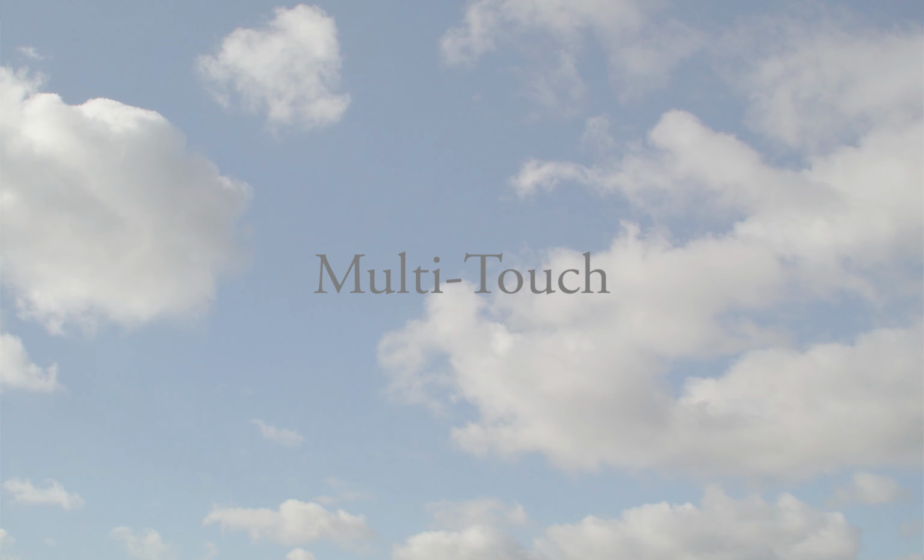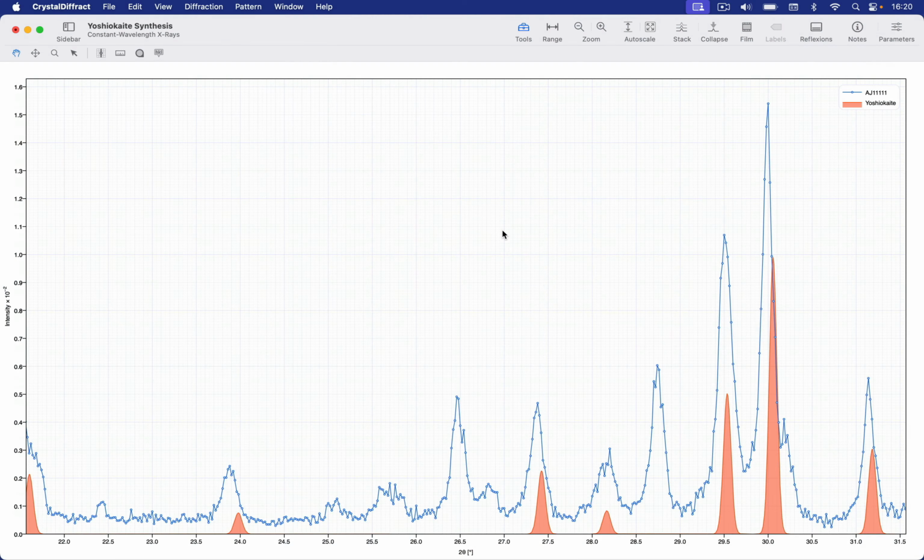For many Mac users, the easiest way to scroll and zoom will be via a multi-touch trackpad. Windows users might have a multi-touch screen. Two sets of gestures are possible.